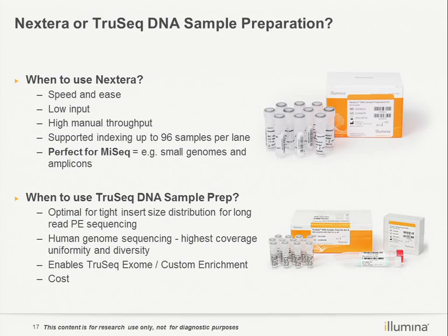So when we compare the first two series, one is Nextera, the other is TruSeq. When should I use Nextera? When should I use TruSeq? For Nextera, if you care about speed, the turnaround time of your sequencing experiment, and you care about ease of use, or your input sample is a bit low, you can try Nextera.